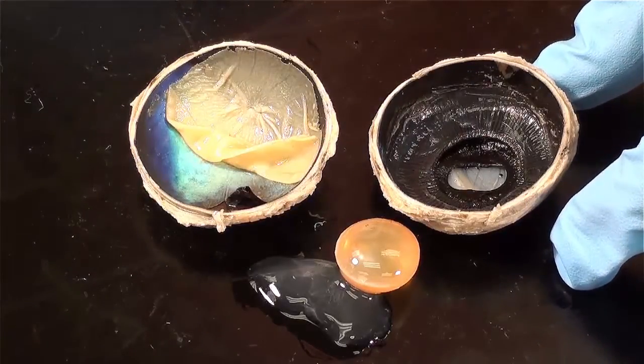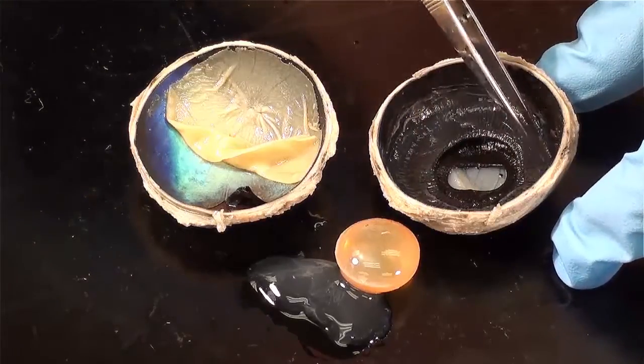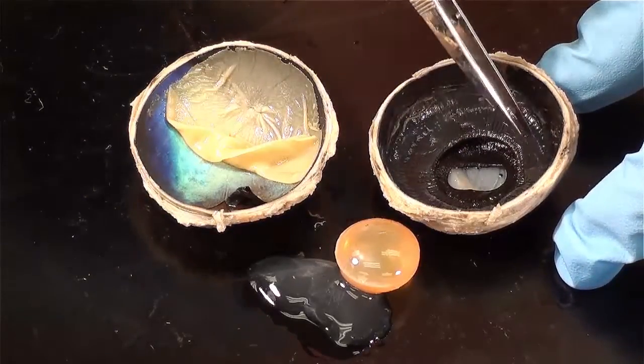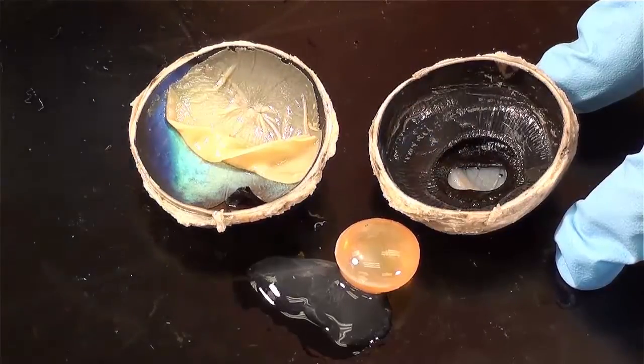It would be blue, green, or brown in humans. If you look a little further out, you can see a circle of material that has tiny ridges on it. That's the ciliary body.